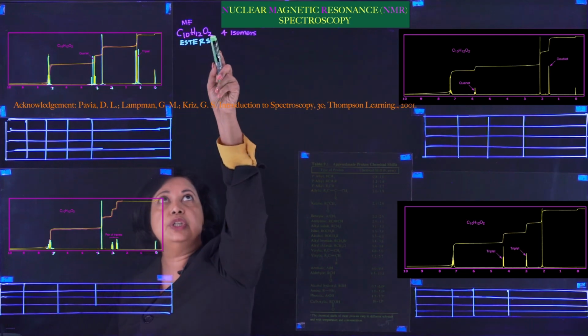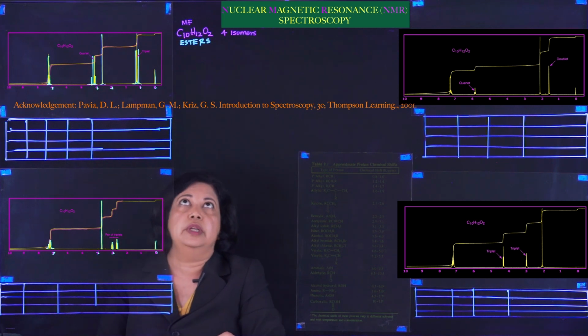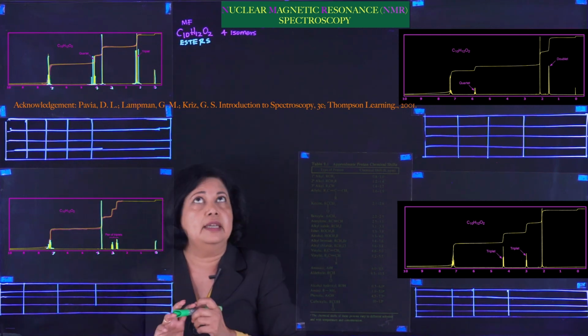We have 2 oxygens here, and so that we have to take into consideration when we solve the problem. The heteroatoms are very important.